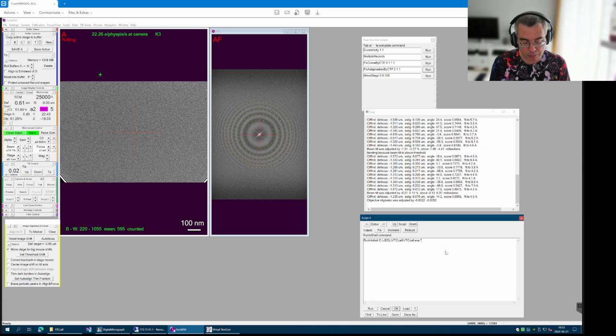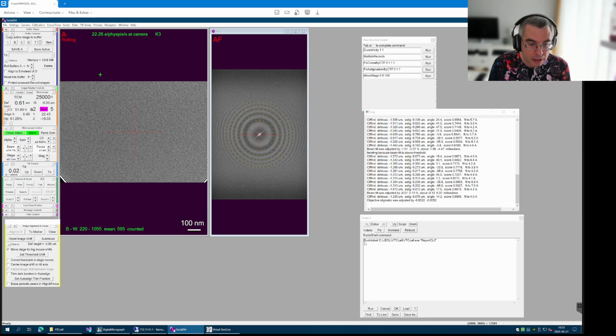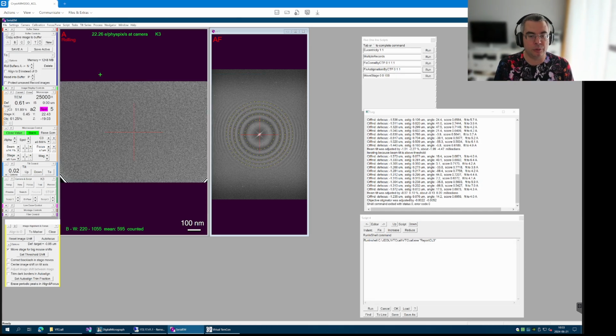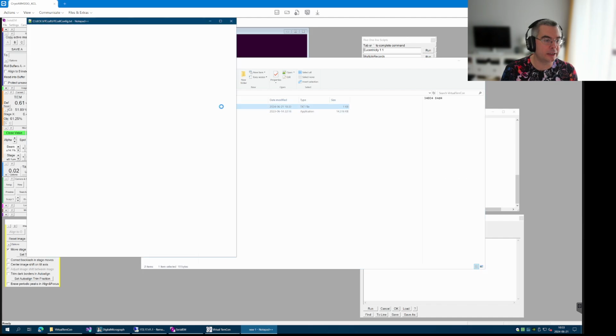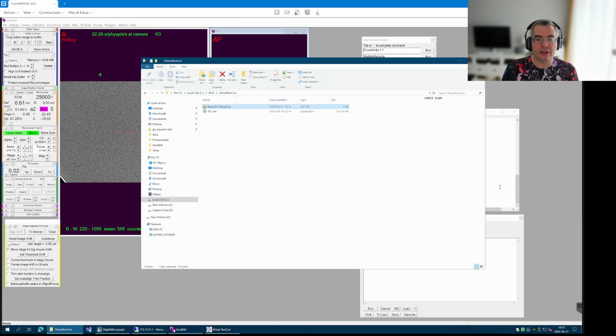And then, for example, we may want to say report CL3, which will put the value of the CL3 lens into a text file. Sorry, there is a typo here. Run in shell. That's what it is. Yeah, and then we can see that it's exited with 0, and then we get the CL3 value written here into this text file as a decimal and hexadecimal number. So we can use it that way.